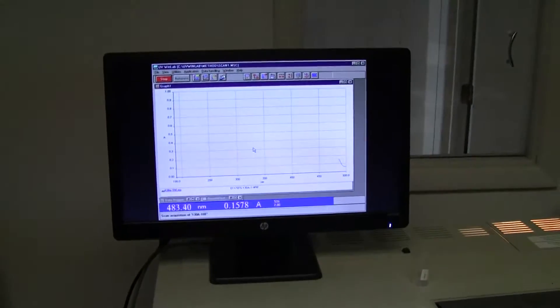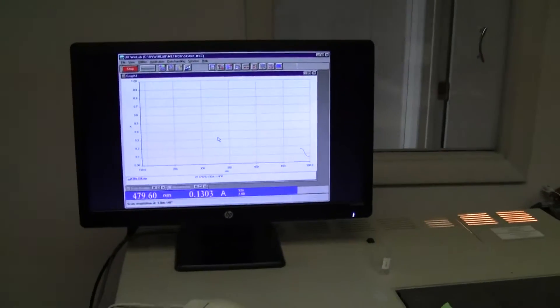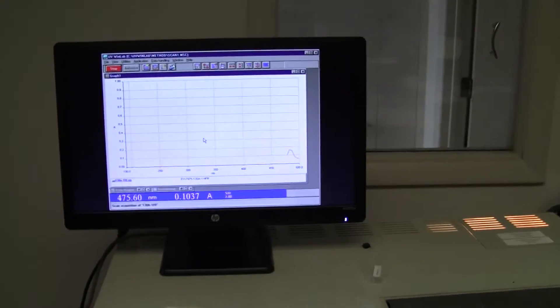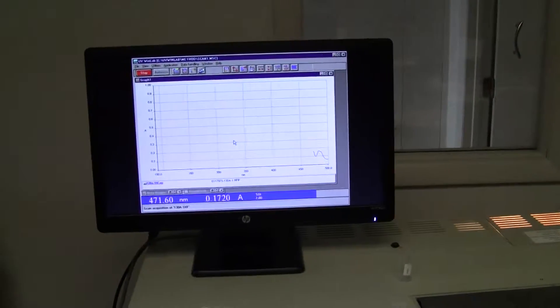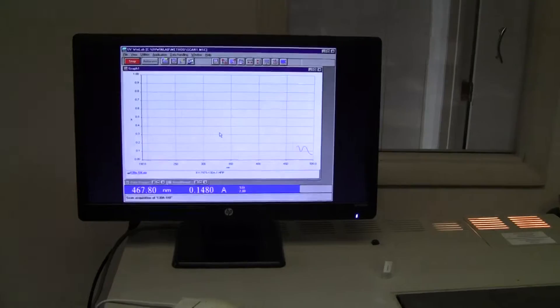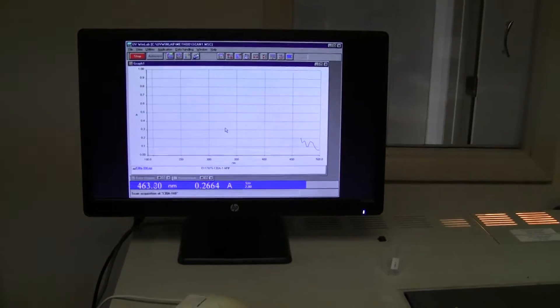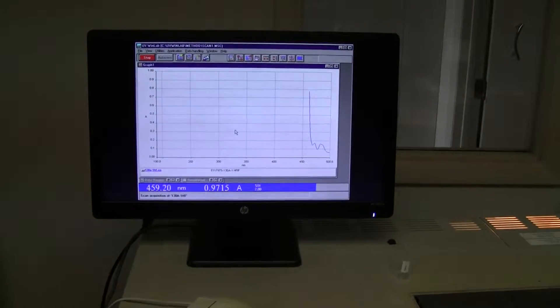Hi, this is Michael Natal from Hi-Tech Trader. Today we're looking at a Perkin Elmer UV-Vis spectrophotometer. The model number is Lambda 18.